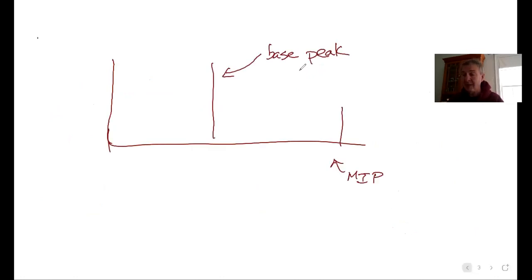It tells you the number of times each peak hit it. In other words, it is what's known as a histogram, meaning it's kind of like a bar graph. It tells you how many of each number. So this is only a relativistic statement. We can't tell absolute truths about it.